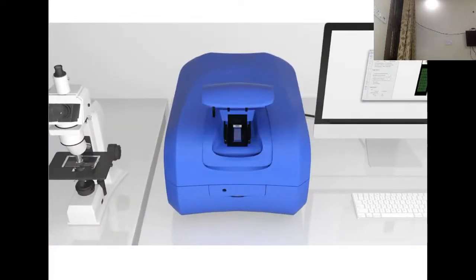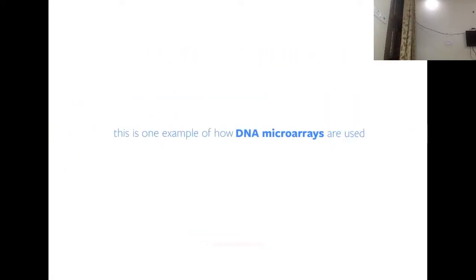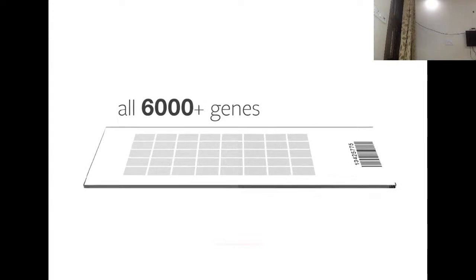After we eject and safely store the microscope slide, we retrieve the red and green images from the computer and create a merged visualization. In the merged image, we see an aerobic gene labeled in green, an anaerobic gene labeled in red, and a gene labeled in yellow that was expressed in both aerobic and anaerobic conditions. This is one example of how DNA microarrays are used. In an actual experiment, quantitative analysis would be conducted on all 6,000 genes.